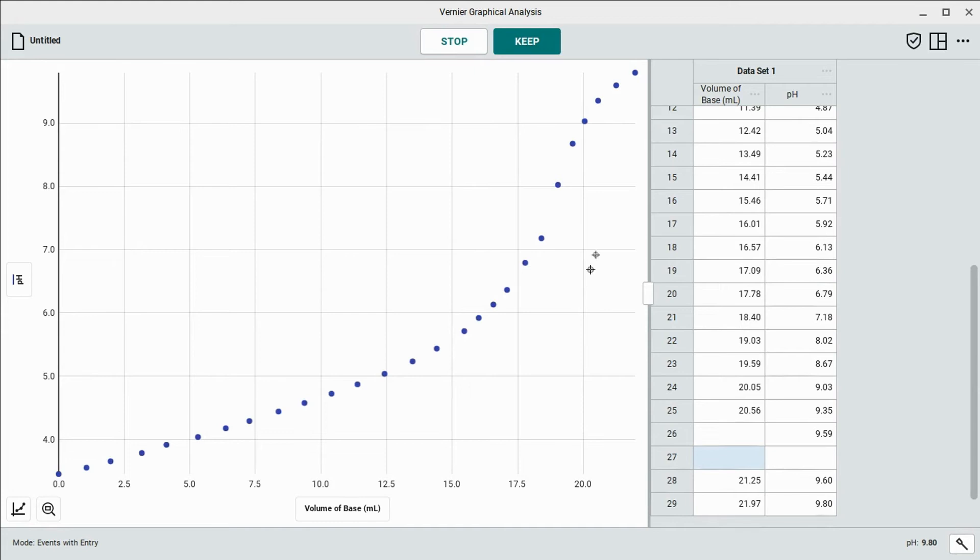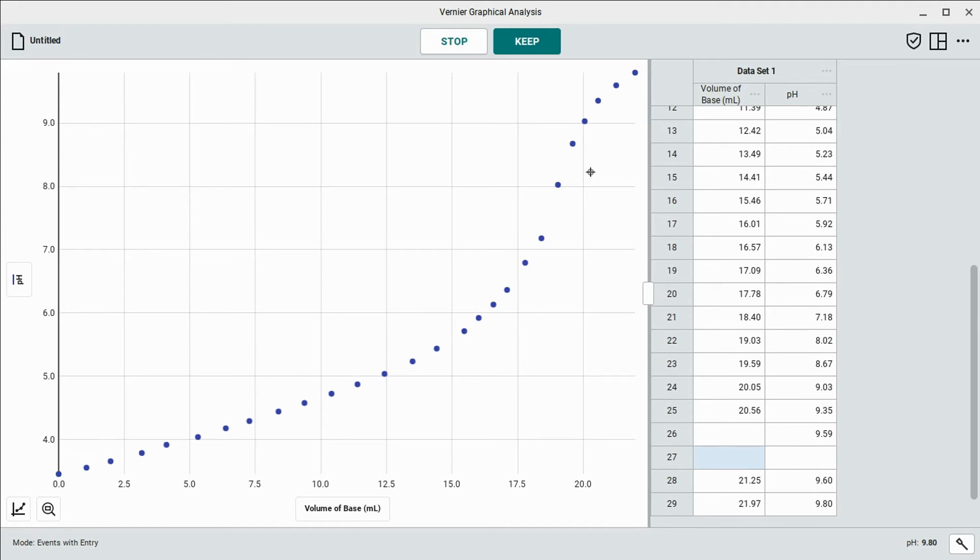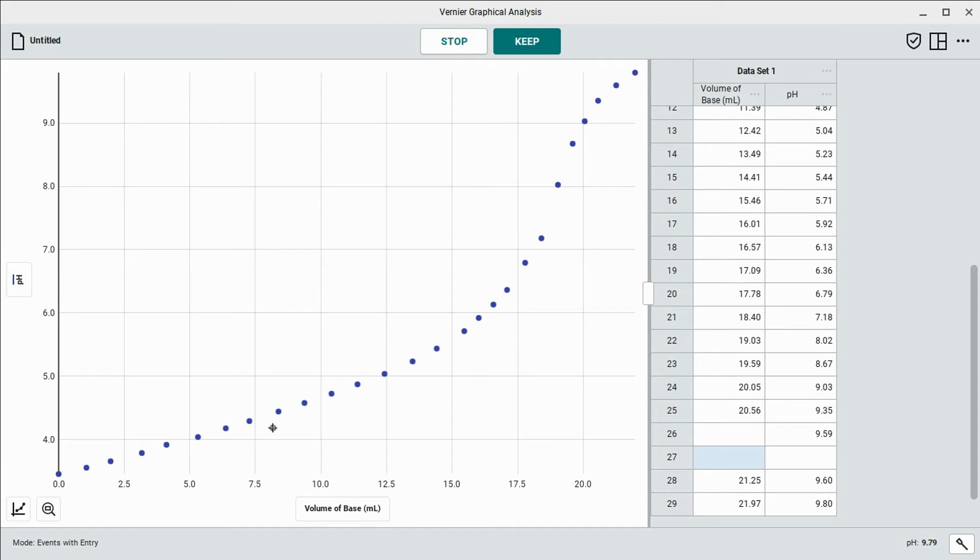Now that we've kind of crossed the equivalence point here, we can go ahead and start adding a little bit more of the sodium hydroxide at a time. So probably bump it up to about a milliliter at a time, maybe a little bit more. I'd probably go to about 11, a pH of 11 or so. If it doesn't quite get there or goes a little bit past that, that's fine. But that'll just give us enough data points on both sides of the equivalence point here.